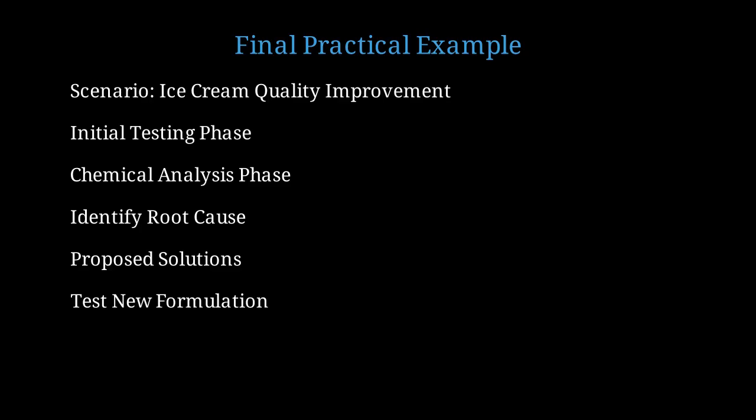Hardness to 2,800 grams force. Sensory panel rates smoothness at 8.2, up from 5.1. Store samples at -18 degrees Celsius for 12 weeks. Monthly testing shows ice crystal size remains stable below 40 micrometers. Success. Food testing is both science and art.